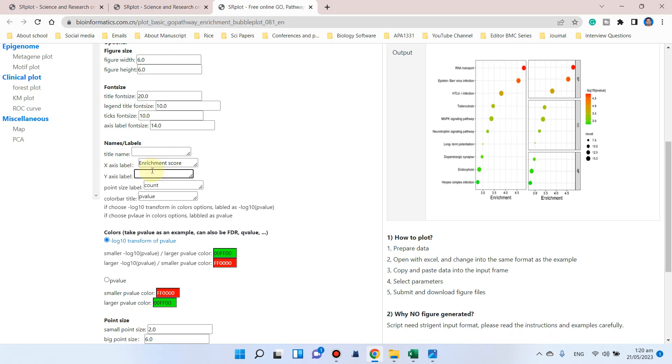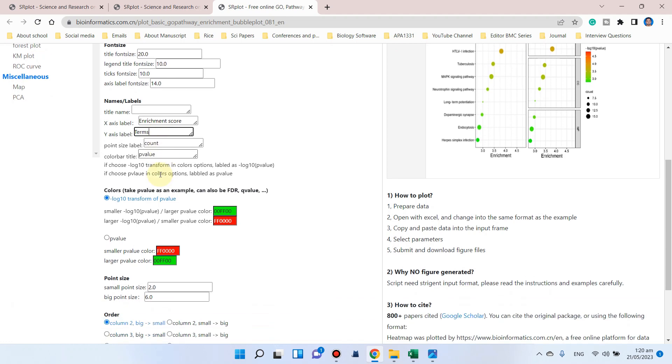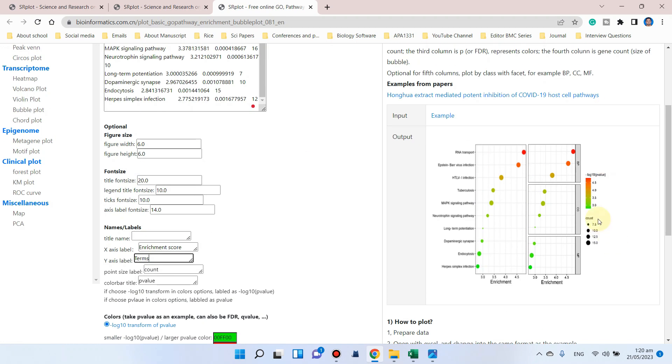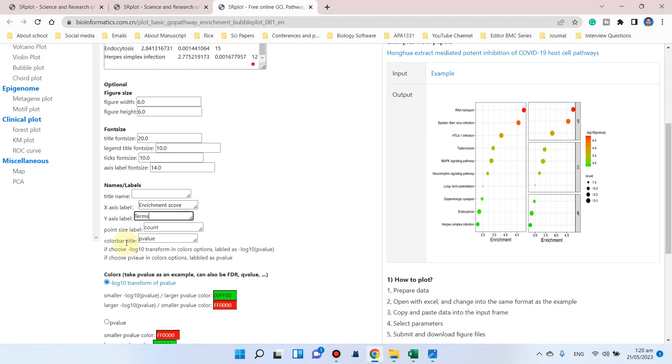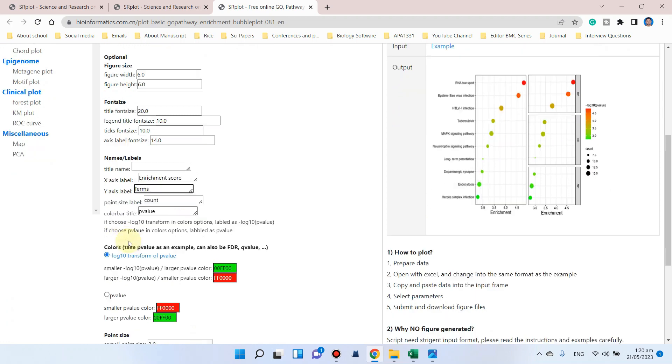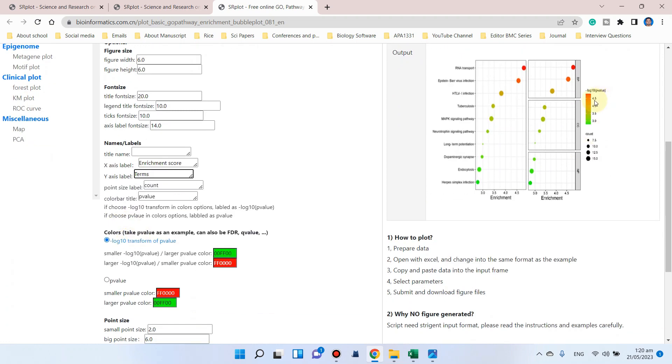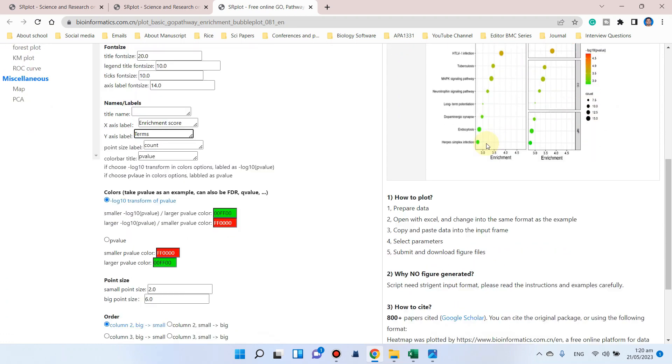So here we can write terms. Here we can see the point size is showing the count value, and the color bar is showing the p-value.